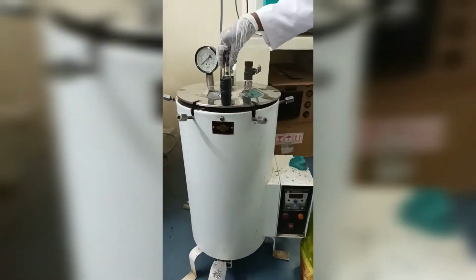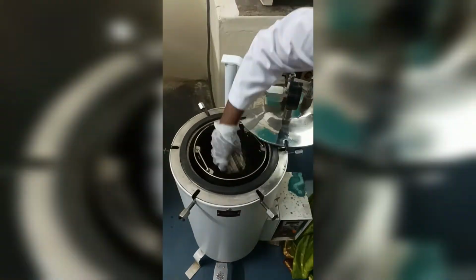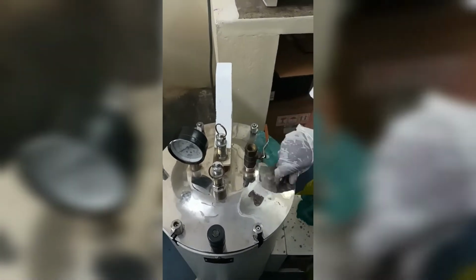Autoclave. Place the nutrient agar medium and petri plates in the autoclave. Close the lid. Tighten the screws properly. Switch on the autoclave. Autoclave uses saturated steam under pressure of approximately 15 pounds per square inch to achieve a chamber temperature of 121 degrees Celsius for 10 to 15 minutes. LBS means libra balance scale.